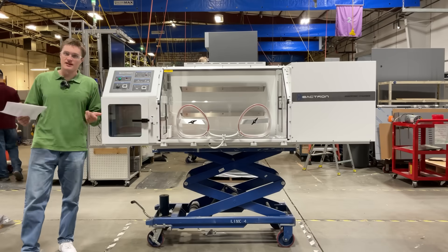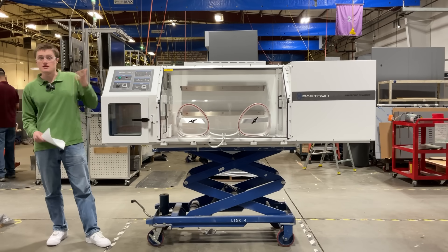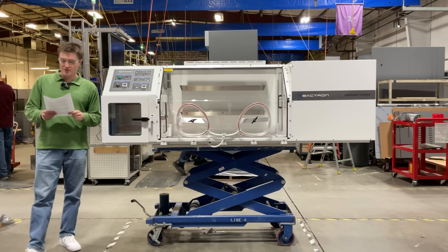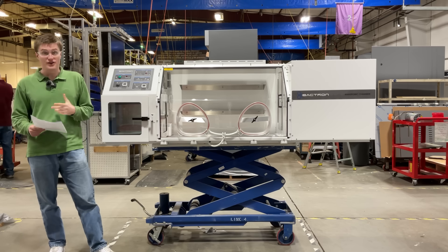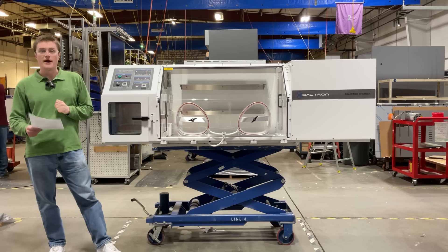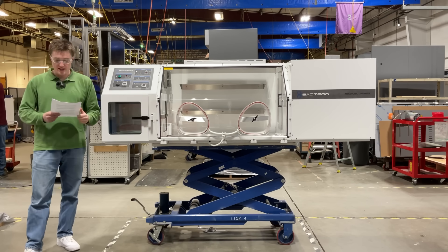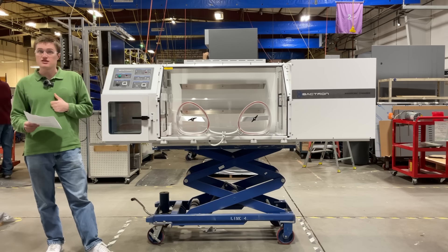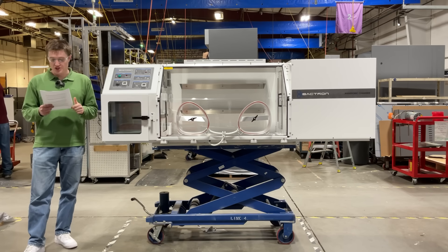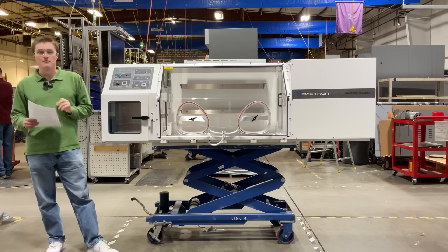My name is Kord Sankstake. I'm a design engineer here at Sheldon Manufacturing, and today I'm going to be introducing the Bactron 600 anaerobic chamber, a cutting-edge solution designed to provide reliable, contamination-free anaerobic conditions for a wide range of laboratory applications. This spacious workspace is built to support high-throughput anaerobic research, clinical diagnostics, and industrial microbiology, providing an oxygen-free environment with unmatched precision.